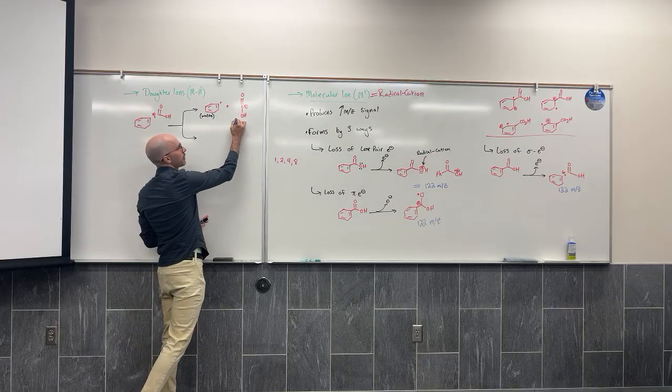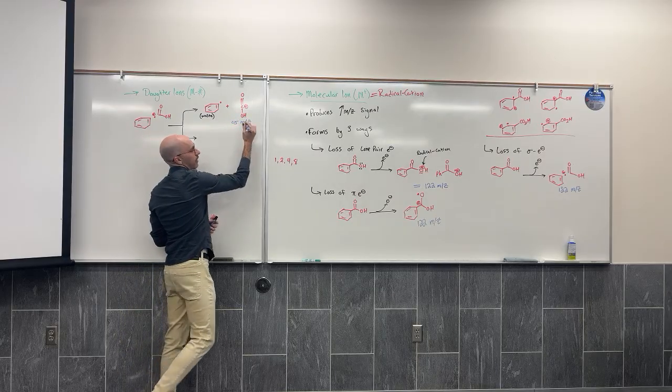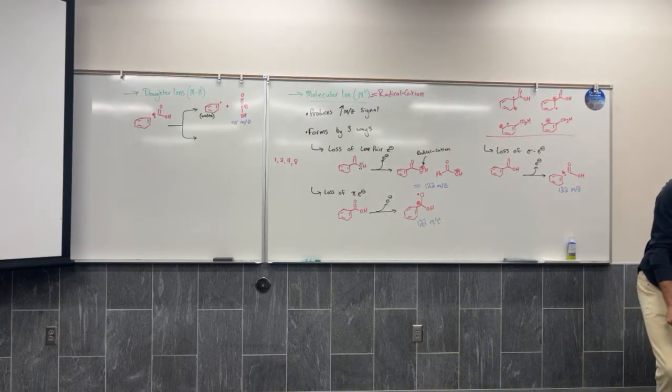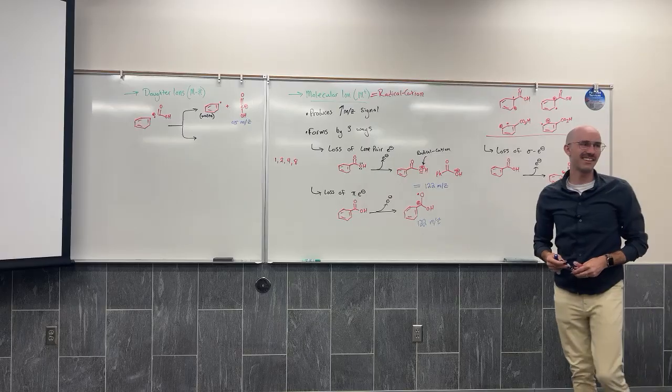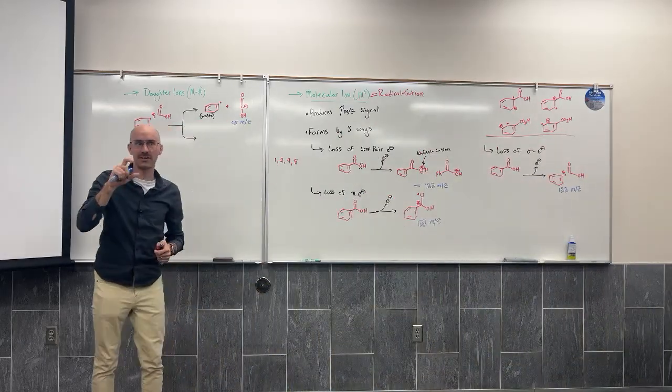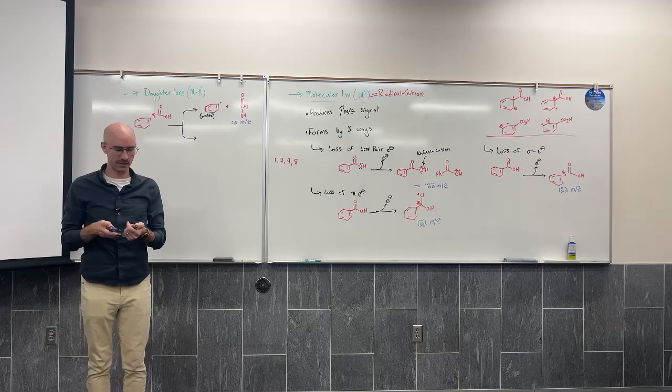This, in theory, would have a hit at the detector at 45 mass per charge. Do we see anything at 45? The tiniest little thing. I do have a signal at 45, but it's not a major signal.